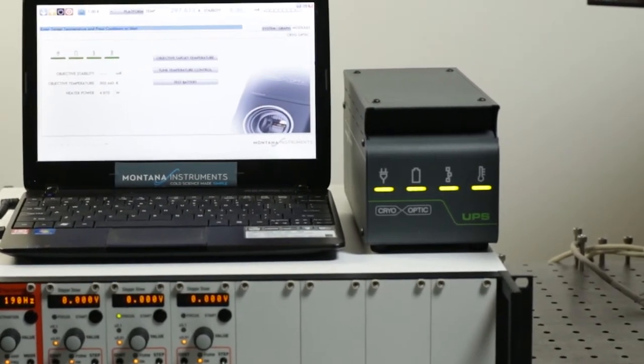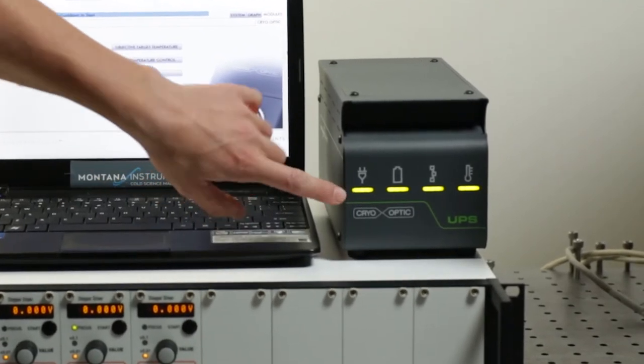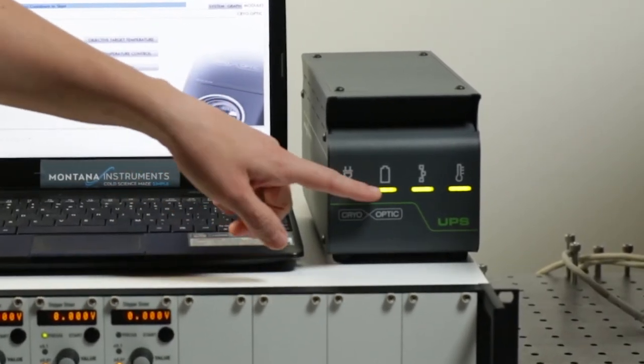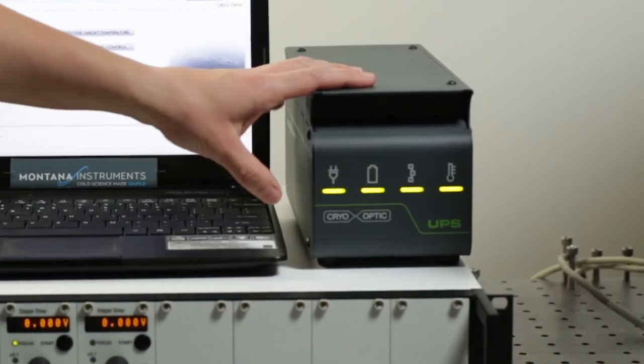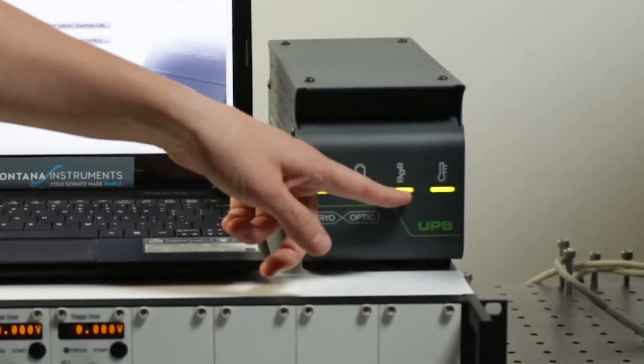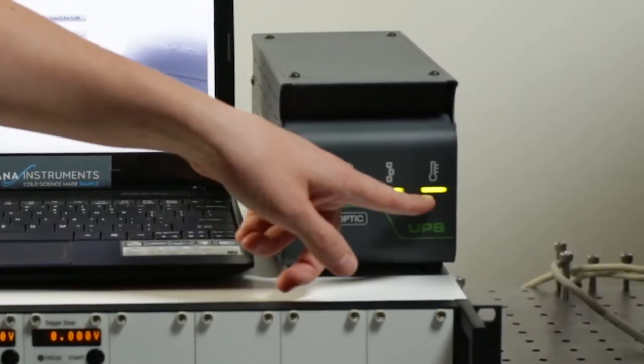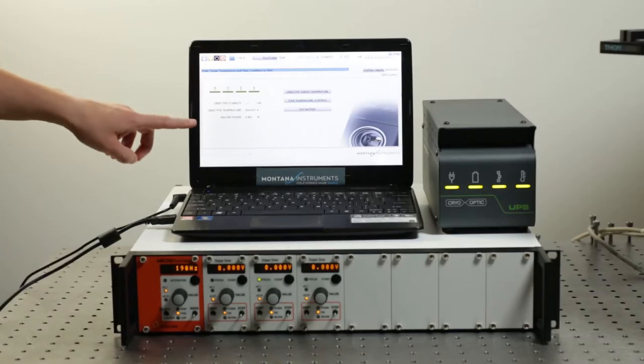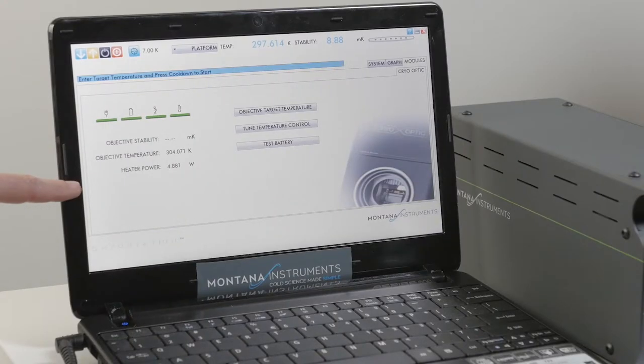The four LEDs indicate that it's plugged into wall power, the battery in this unit is charged, it's connected to the computer and it's reading the temperature from the objective. This is also recorded in the software as well.